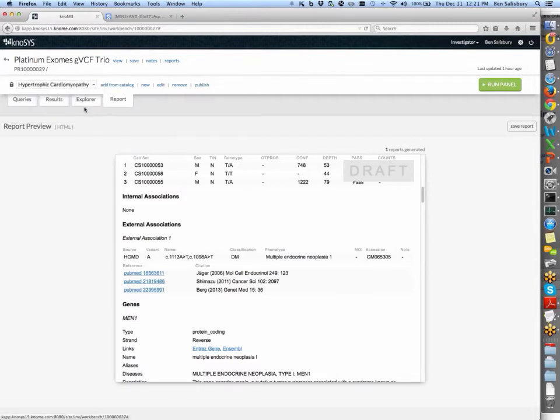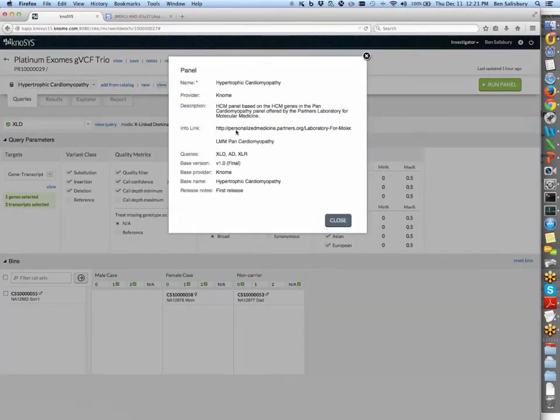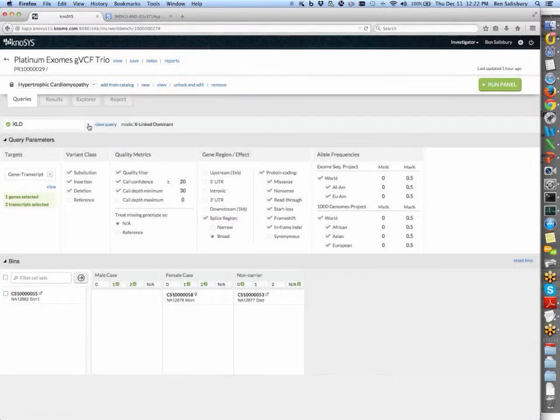Now what I'm going to do is take us to the hypertrophic cardiomyopathy panel, and this one, if we take a look here, this was based on the list of genes tested out at the Laboratory for Molecular Medicine. So that link's available to follow. And there were a number of genes specifically tied into HCM as a trait, and they follow 3 different inheritance patterns: X-linked, dominant and recessive, and autosomal dominant, which, like the ACMG panel, is where most of those genes reside in terms of their inheritance pattern.